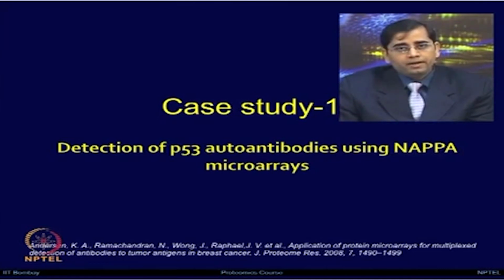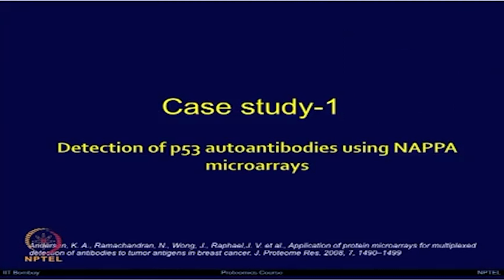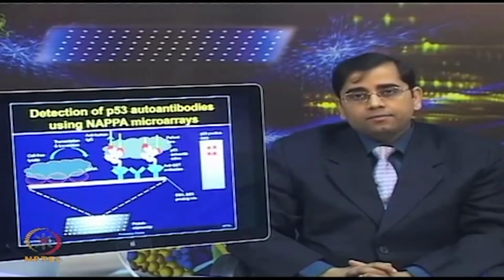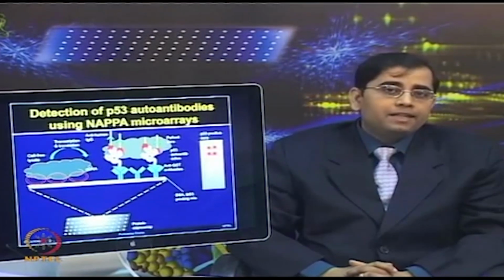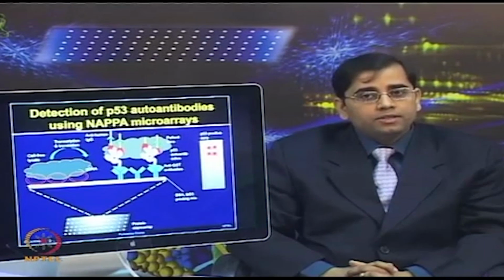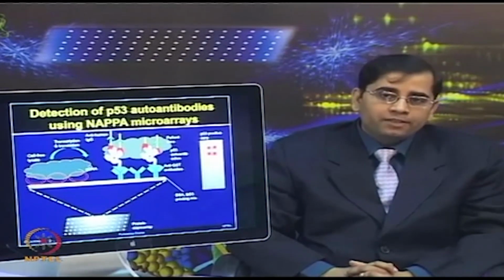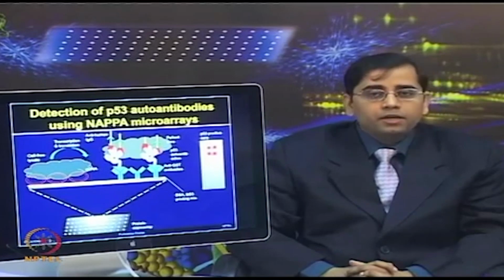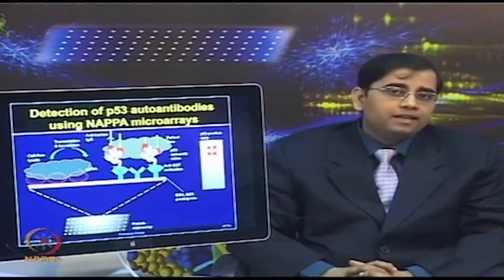The study was performed by Anderson et al. Antibodies to several tumor antigens have been identified in breast cancer patient sera. However, there is very little knowledge about the specificity and the clinical significance of the antibody immune repertoire in breast cancer patients.